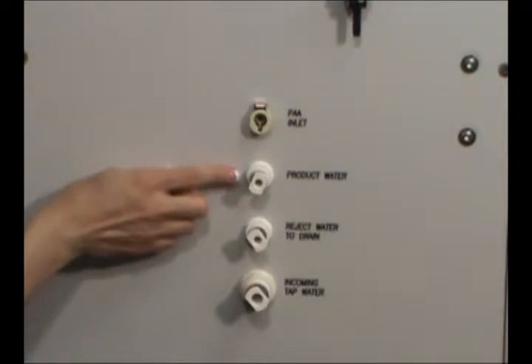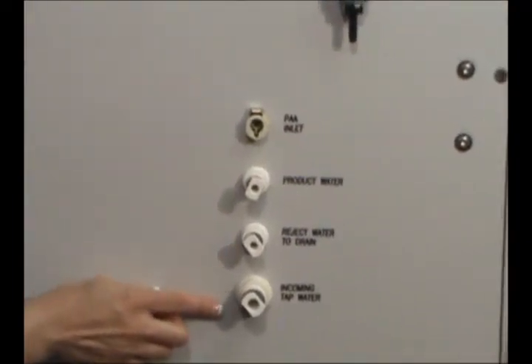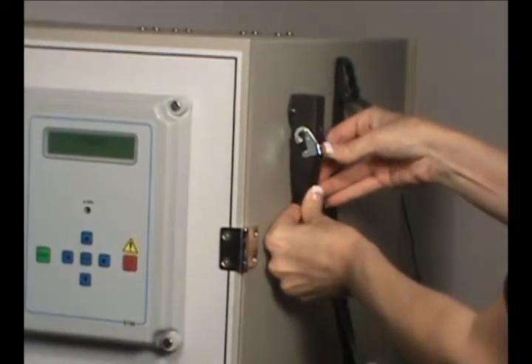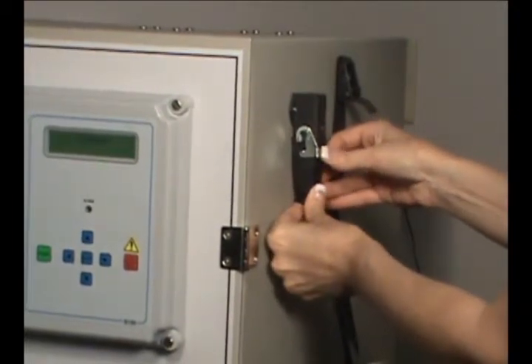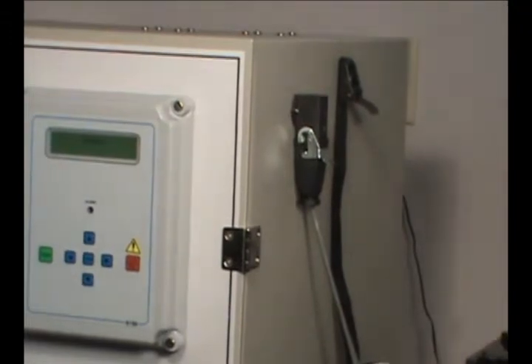The product water, reject water and incoming tap water connections are conveniently located on the front of the RO unit. The storage tank level connection tells the RO the water level inside the storage tank, automatically generating more water when necessary and avoiding overfilling.